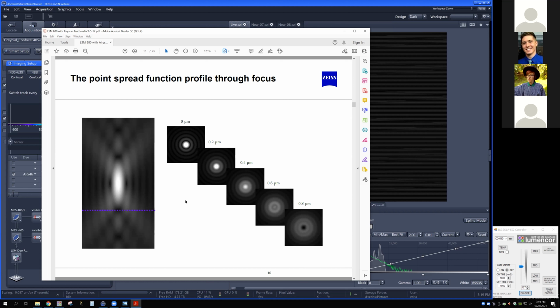And that's confocal right there. And that's also the definition of the Airy unit that we're working with. Now, for different wavelengths, the shorter wavelengths would have a tighter pattern, so the diameter would be a little bit smaller. Longer wavelengths are going to have a pattern that's a bit more spread out, a little bit larger, and so the pinhole would technically be in a slightly different spot for those.